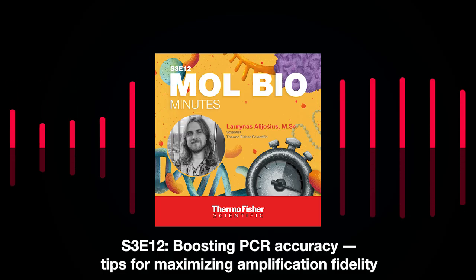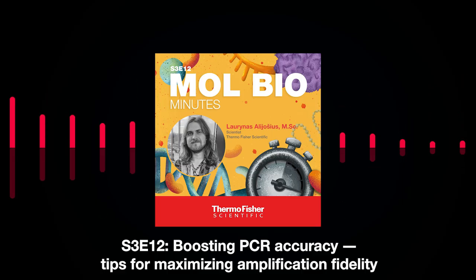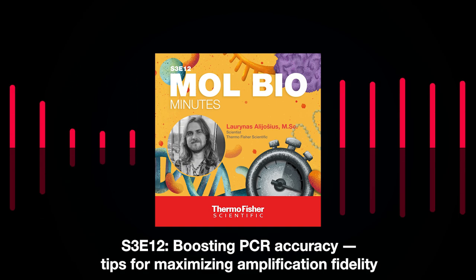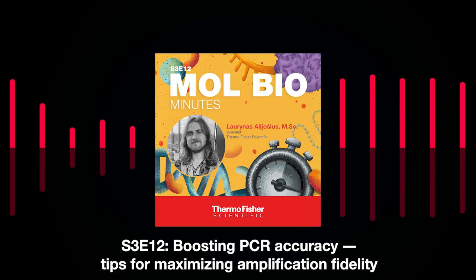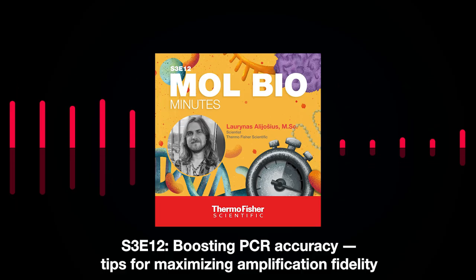We're going to talk about the accuracy of the polymerase chain reaction and everything that comes along with it. First things first, let's talk about the benefits of having an accurate PCR. Accuracy suggests that there will be fewer errors introduced during your PCR reaction, so automatically you will have a higher confidence in your results, and that's great, right?